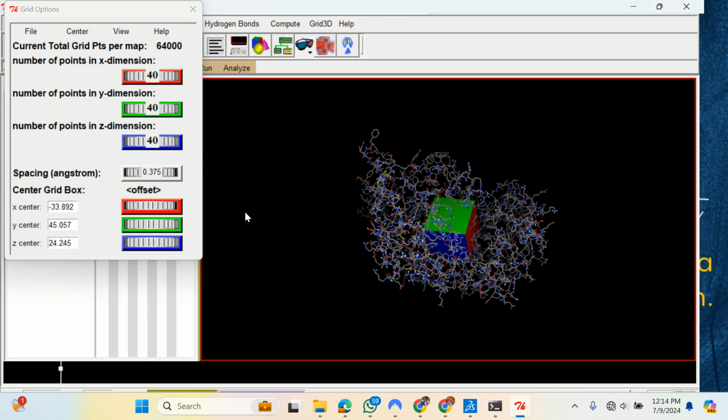Are you getting that? So to do that, I told us earlier that each amino acid in this particular protein has a coordinate. This is what I mean by coordinate or has centers. It has center X, Y, Z. Whenever a box is concerned, a box is like a cube, right? It always has three major sides. So this is like the X, Y, Z of this.